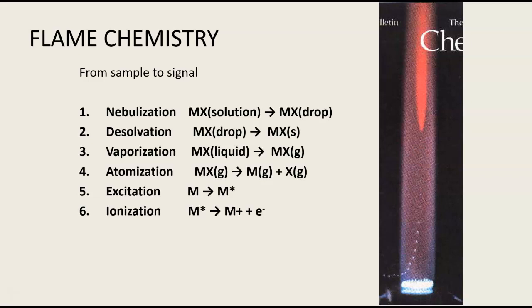The picture that you see is from Gary Hieftje's lab at Indiana University, and it shows a flame, and you see the droplets that are being injected that come in from the left, and they slowly get smaller. The way they're doing this is by using a strobe light behind it. And so you can actually see the droplets spread out as they're accelerating in the flame, and they get smaller and smaller. That's the desolvation process that's taking place.